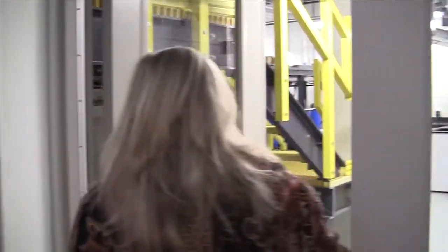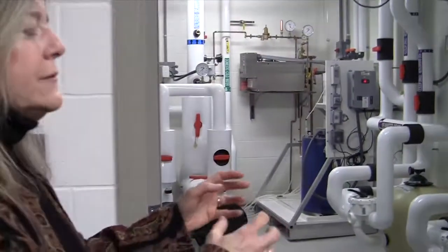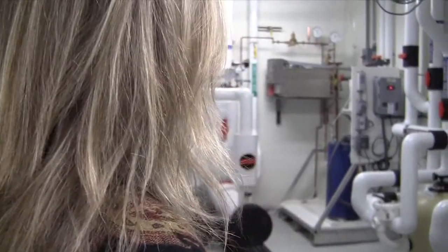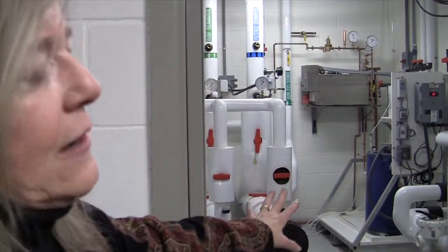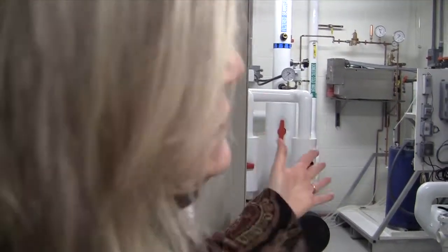Lots of air and light again, but if you come in here, what I was mentioning, we have the shore facility that pumps water up here to the sea filtration system so that we can actually manage the water and make it whatever conditions we want for the experiments that we use here. The seawater pumping is run by solar energy, and that is part of our ability to become designated as a platinum facility because we are using solar to do that.